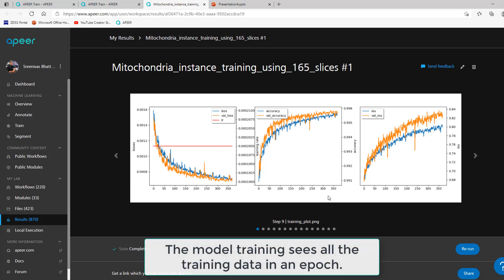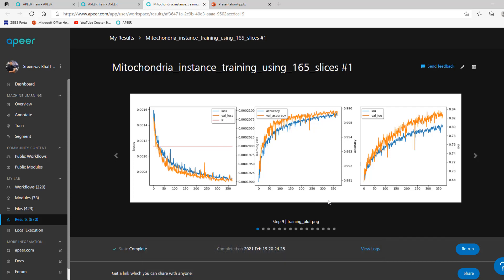An epoch is when the training sees all your training data, and the total number of epochs depends on various factors, including the size of your data.